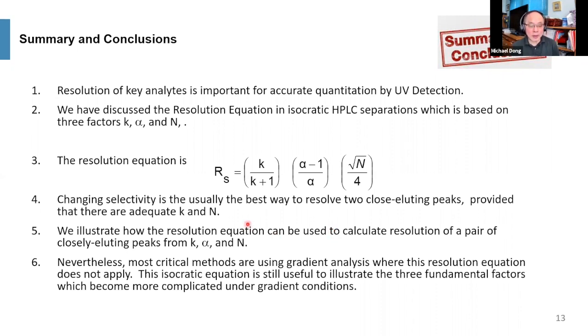Okay, so in this webinar, we illustrate how the resolution equation can be used to calculate resolution. And it's actually a good match to the measured resolution. Okay, so finally, we say that for very critical methods using gradient analysis, the resolution equation really does not apply because it's very complex, right? So there's really no k in gradient. You also cannot measure plate count under gradient conditions, right? So this equation is really not for gradient separation, where the critical method uses gradient separation.